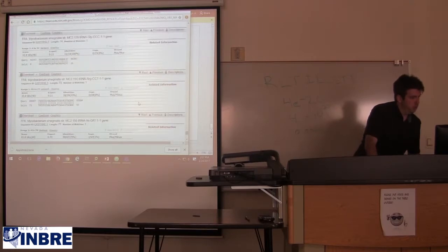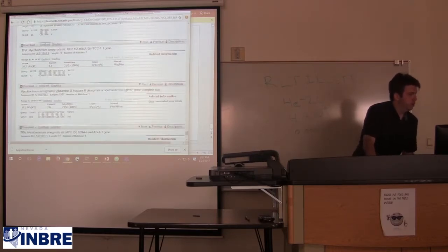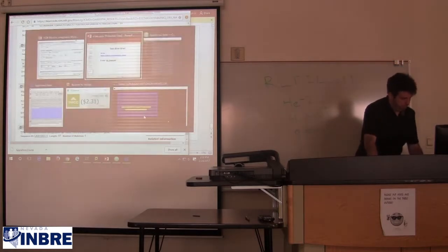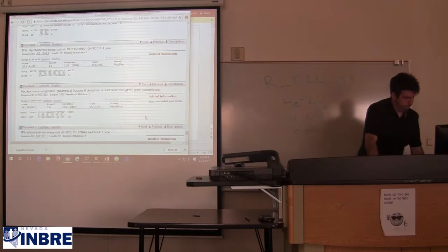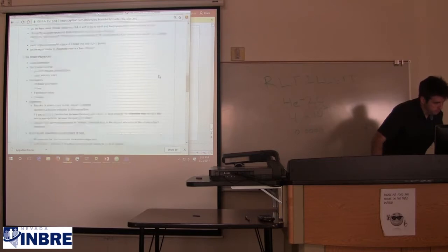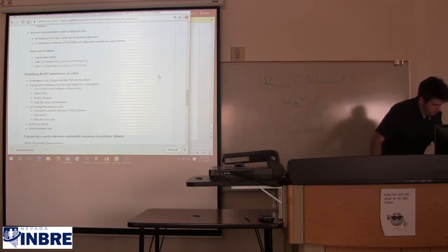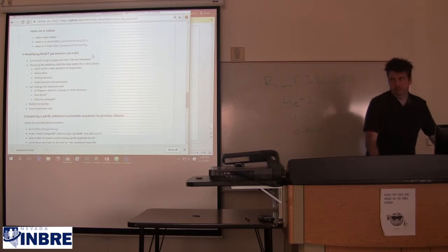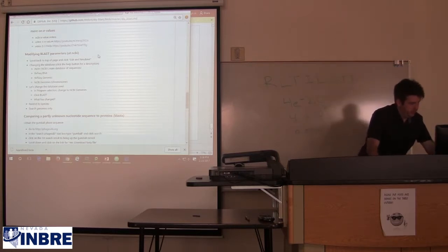Yes, definitely. So it's an L-glutamine fructose 6-phosphate aminotransferase gene. Okay. 21 letters of perfect match. It's not quite enough to do much at all, but it's a perfect match. I'm going to skip this section for modifying parameters at NCBI, because we've actually done some of these as a result of curiosity.